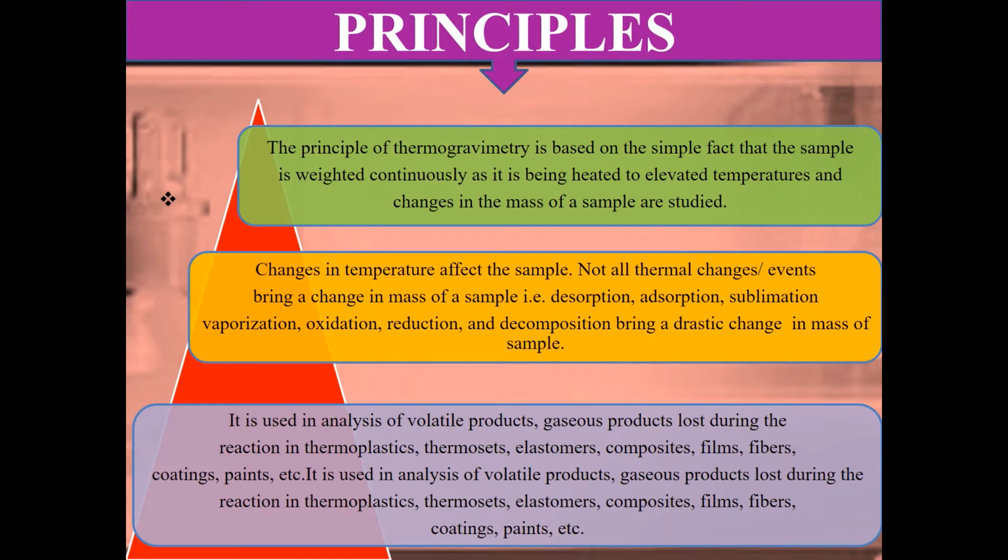It is used in analysis of volatile products, gaseous products lost during the reaction in thermoplastics, thermosets, elastomers, composites, films, fibers, coatings, paints, etc.